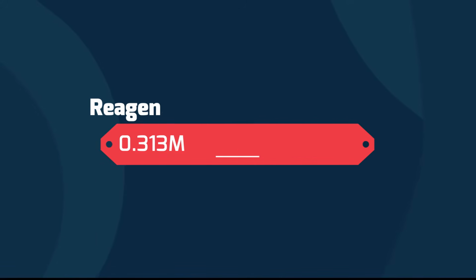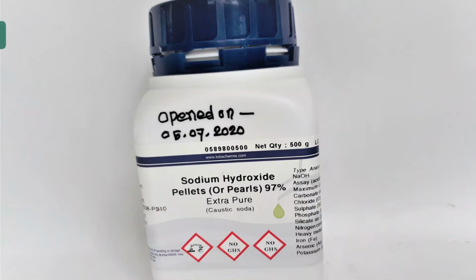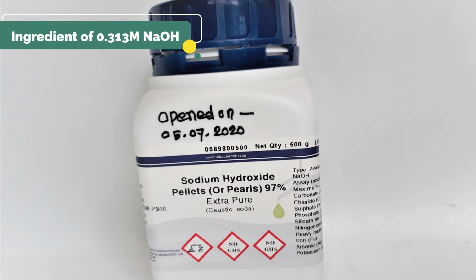Now we are going to prepare 0.313 molar sodium hydroxide solution. To prepare this, we need sodium hydroxide pure pellets.